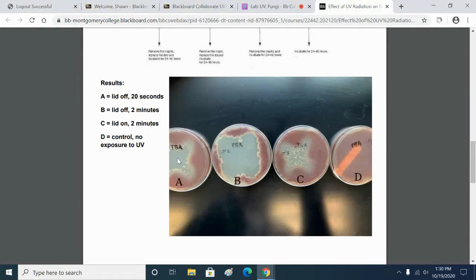Did they become resistant? No, not resistant. They were probably cells that were underneath several other cells, and so they were able to survive because they had some other cells protecting them. But they're not pigmented. So what happened to them?